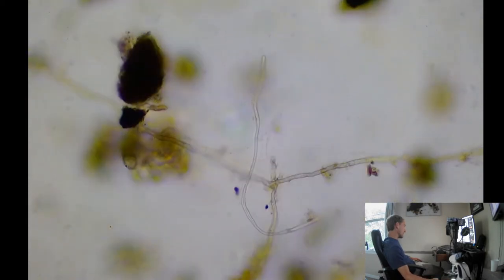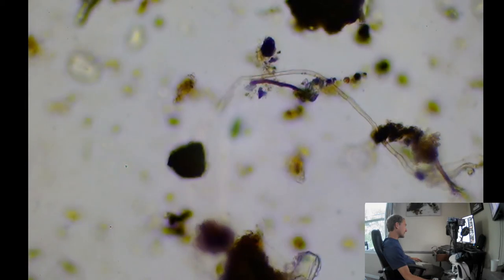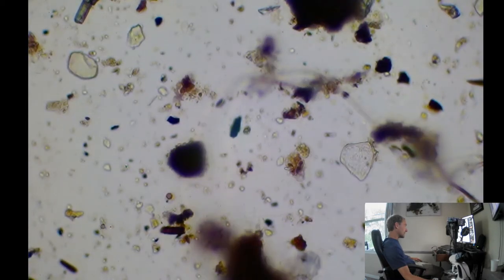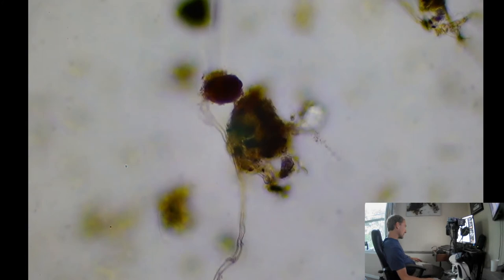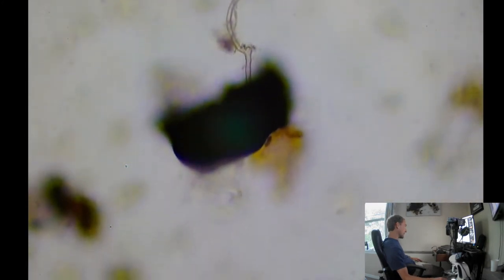See what it looks like over here. Yep, we saw that. It's very long, but very clear. And not seeing any separations in the cell walls, so it's looking more like an oomycete than a fungi at the moment.